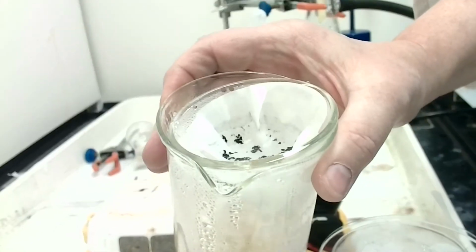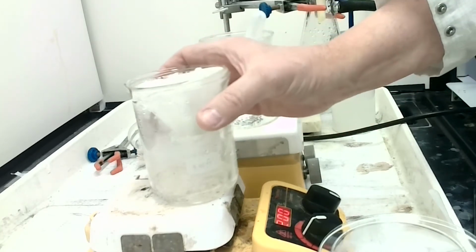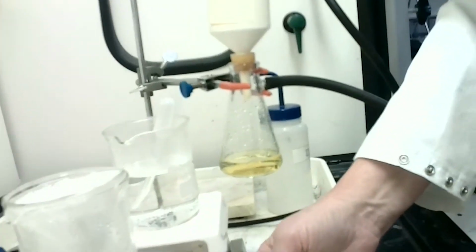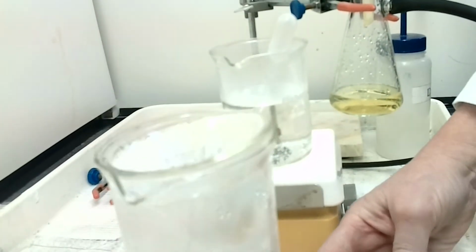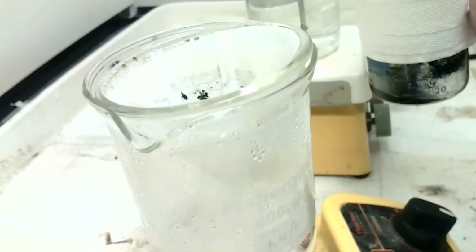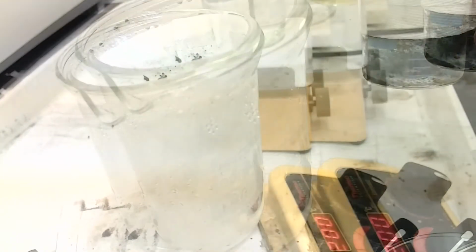So if I look down inside, even though this is boiling hot, I can already see sparkles forming on the paper. I'll move closer. There you go. Can you see the sparkles?